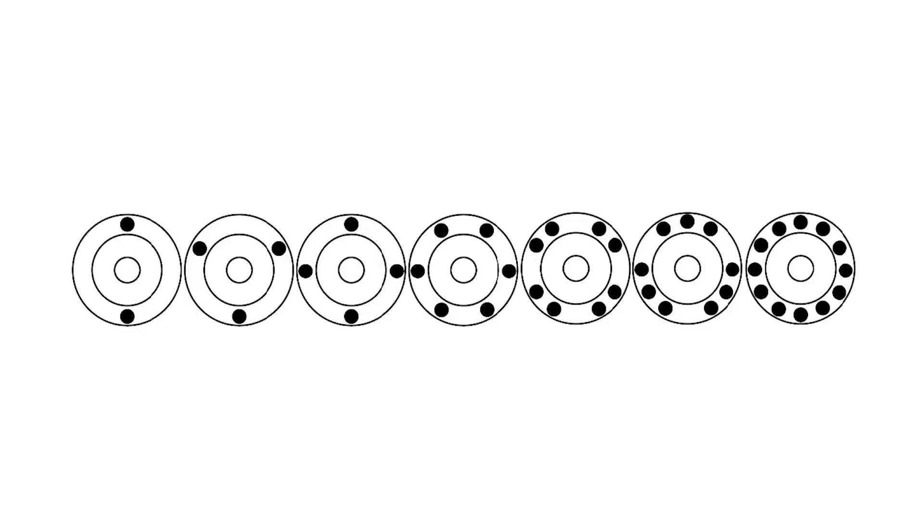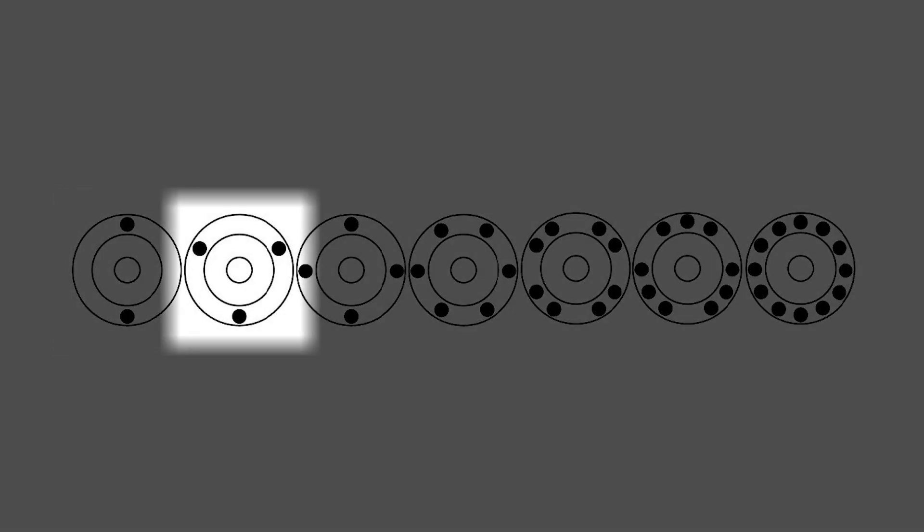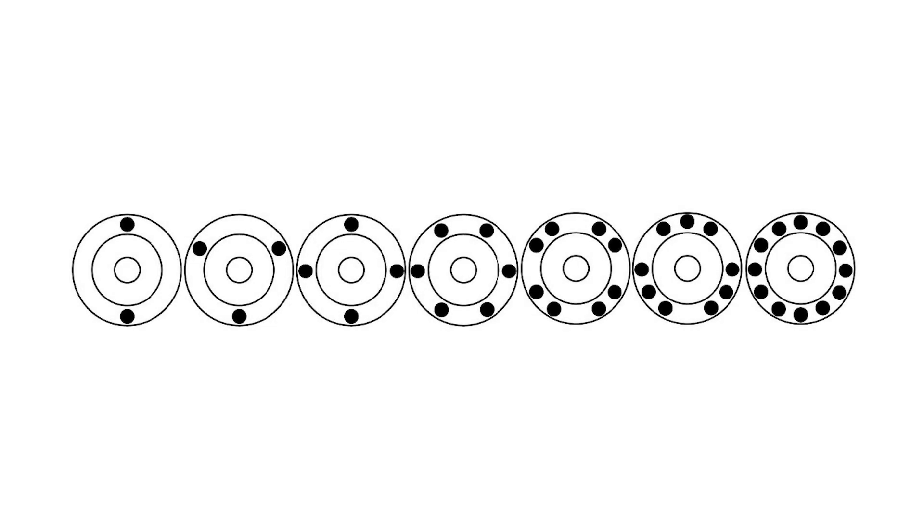Step 2: Load your samples. When loading your samples, opposing tube holders must be of equal weight, as shown in the diagram on your screen. So if we're loading two tubes, put them across from each other. If it's three, make a triangle. Four, a square, and so on.